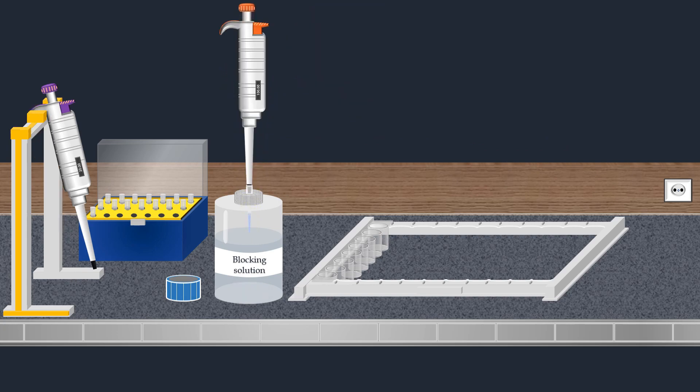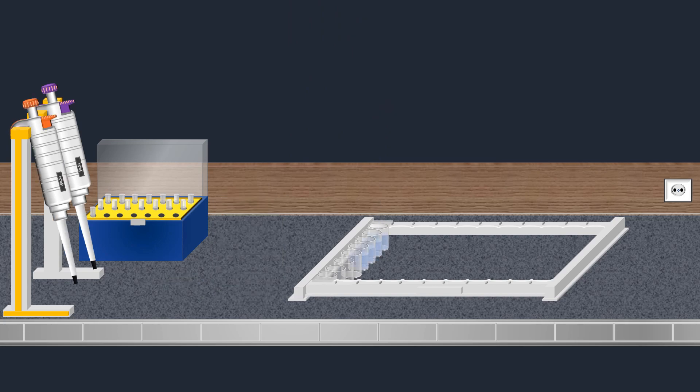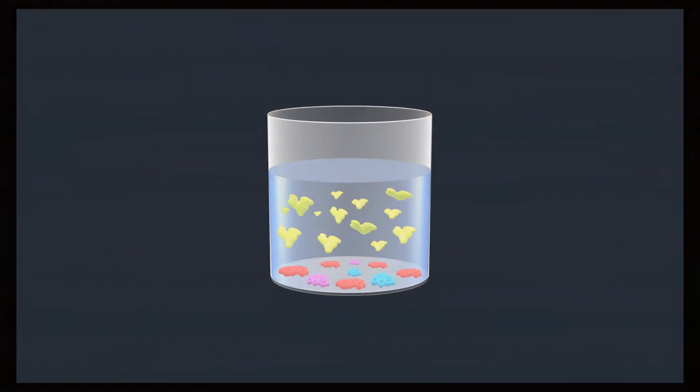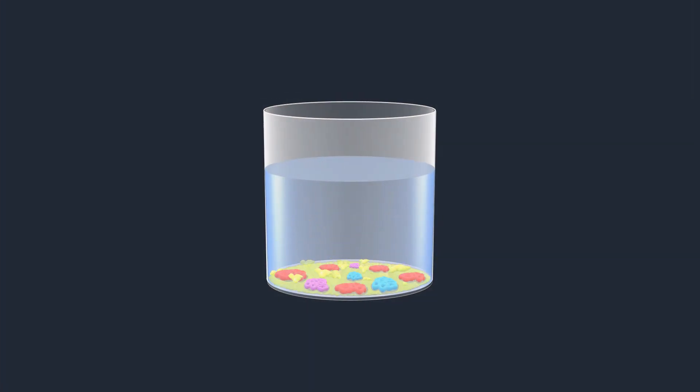The blocking solution is added to each well. Subsequently, the well strip is covered and incubated. The proteins in the blocking solution form a barrier on the plate, preventing the conjugated antibody from binding to these sites in subsequent steps.